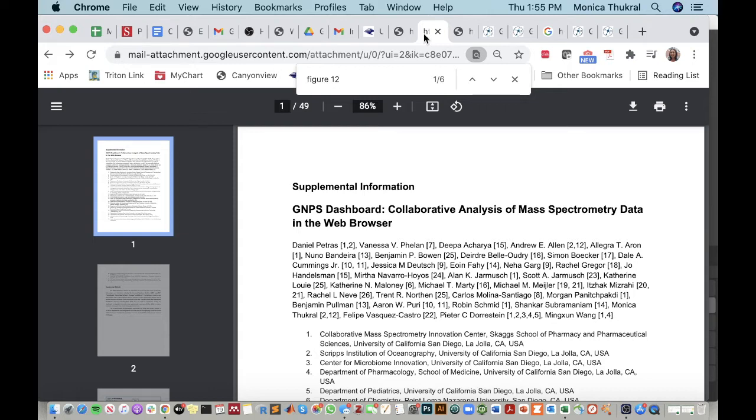In this example, we'll discuss Pseudonitzschia australis, a marine microalga capable of producing a potent neurotoxin, domoic acid, when undergoing nutrient starvation. In the context of studying Pseudonitzschia australis's metabolome, I needed to use 3 LCMS platforms: a Bruker Amazon ion trap, an Agilent 6530 QTOF, and a Thermo Fisher Scientific Q-Exactive Orbitrap.